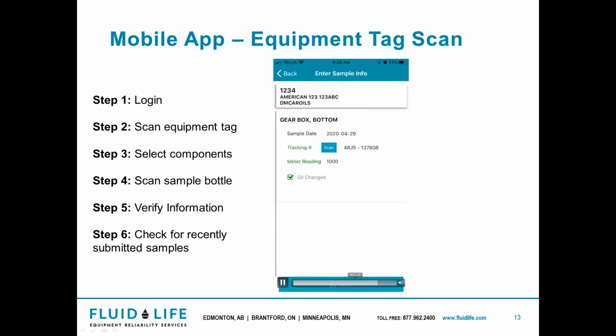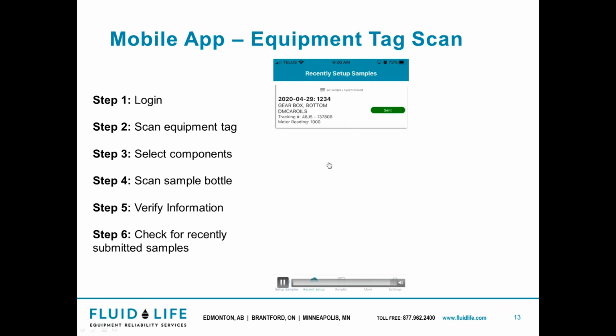Then you're going to press save here on the bottom, and then you can pull down and refresh to see your equipment.